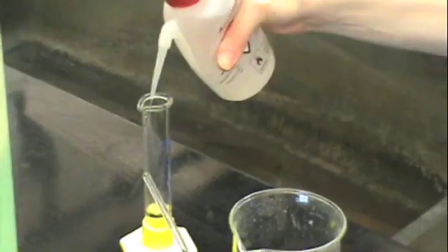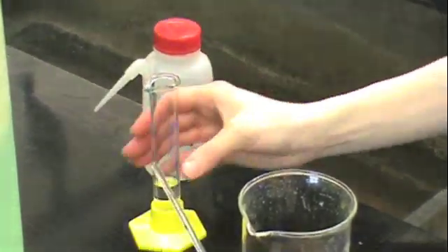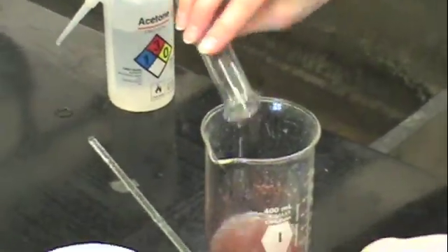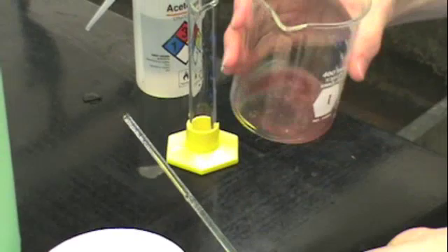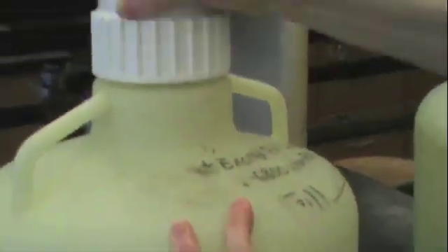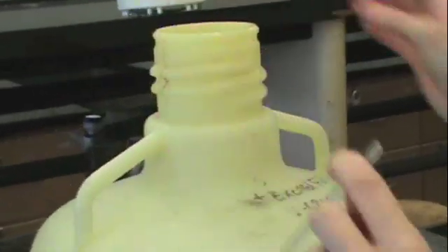Once you've decanted, add 10 milliliters of acetone to your precipitate and swirl gently. This will remove any excess water from your copper precipitate. Then decant the acetone wash into the acetone waste bottle.